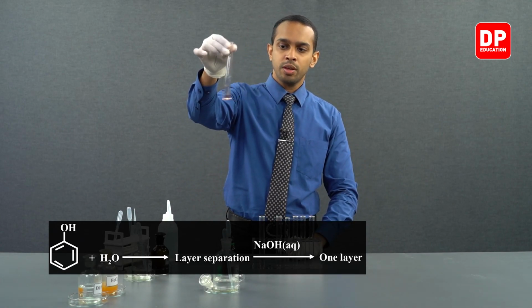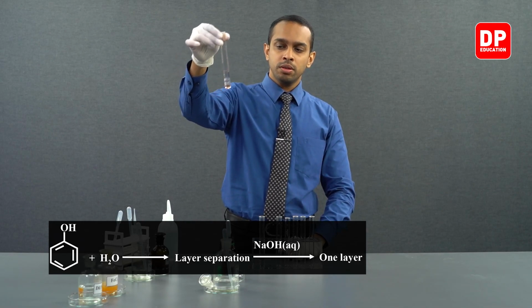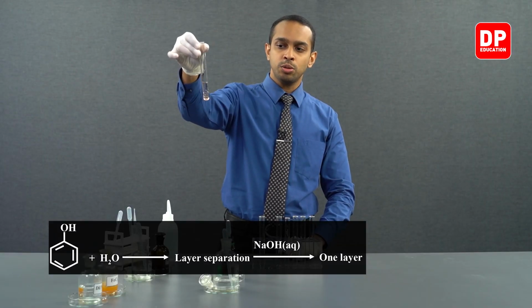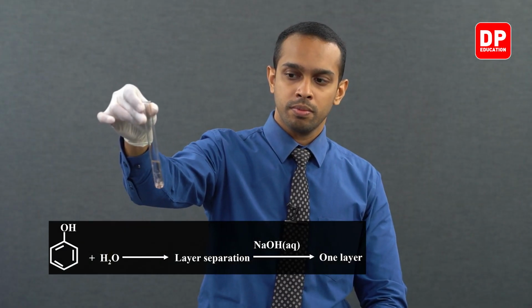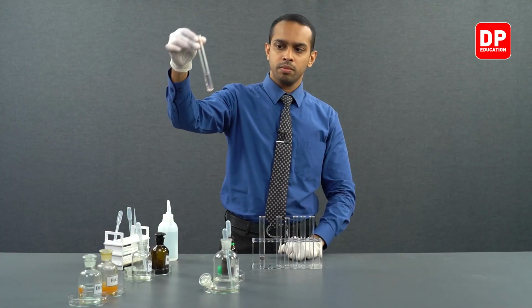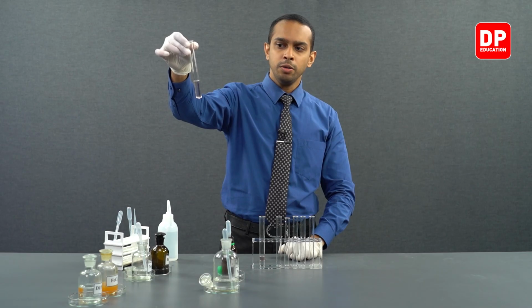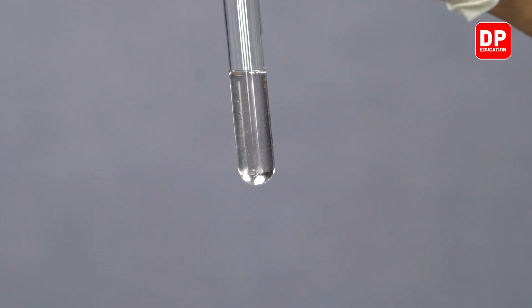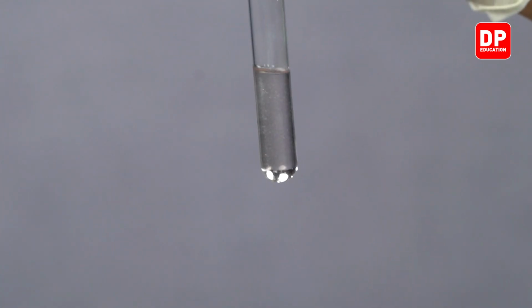As you can see, when sodium hydroxide is added, and if you shake it, the phenol that did not really dissolve in water earlier starts to mix well with sodium hydroxide. But now, after sodium hydroxide is added, you can see it entirely dissolved in the presence of sodium hydroxide and formed a clear solution.